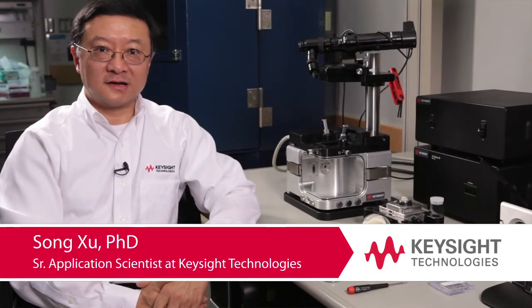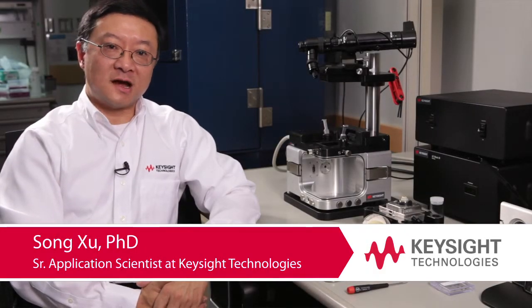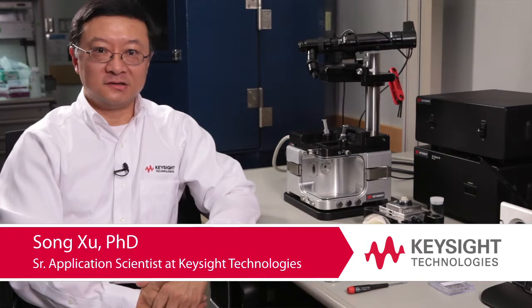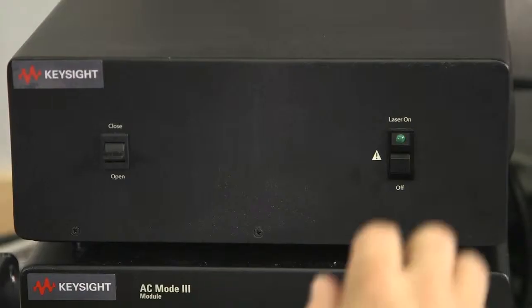Hello, this is Dr. Song Xu of Keysight Technology. We will demonstrate how to align the laser and how to align the detector.